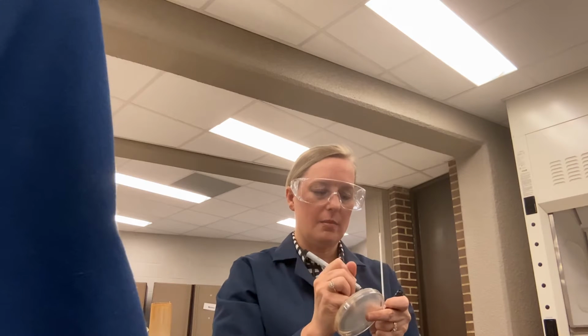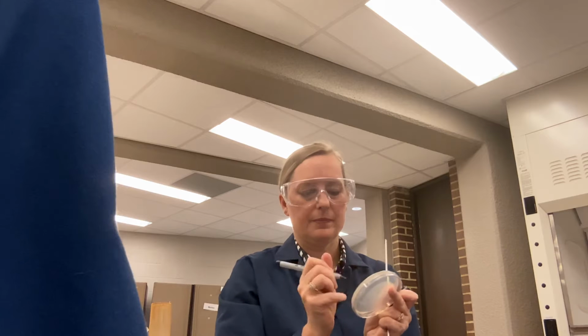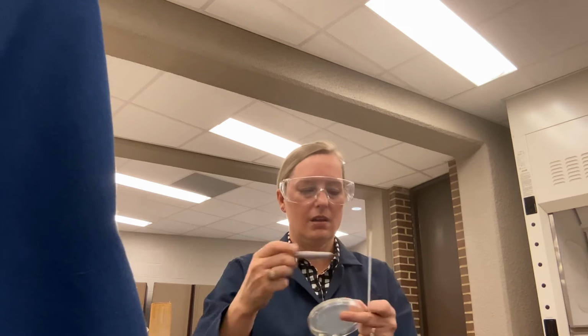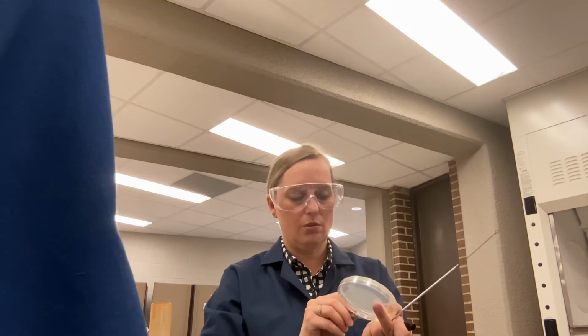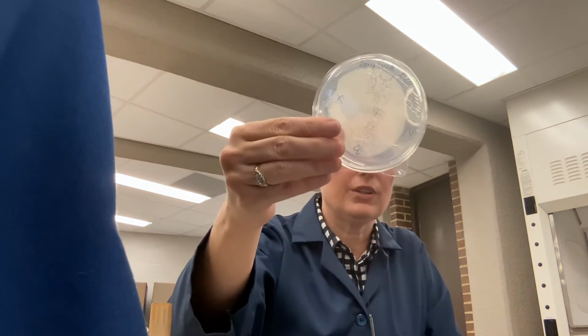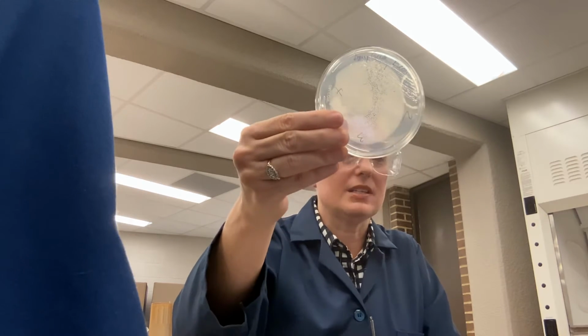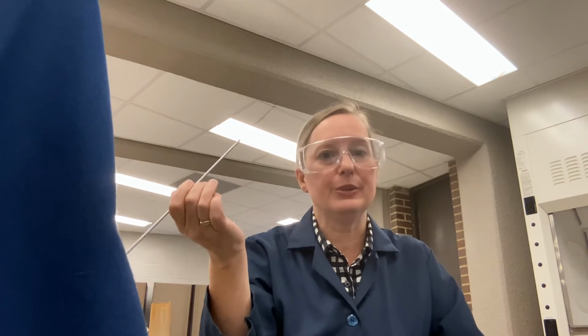And I will go ahead and put some numbers on here so you have a better idea, and I'll show you what that looks like. And the numbers is totally up to you, whatever you want to do. So here I have added 1, 2, 3, 4 on the bottom, because again, if you put it on the lid, the lid's going to rotate. So we're only going to get 1 loop full of broth total. We're not going to go back in because we want to dilute it. We want the bacteria to spread out so we can get individual or isolated colonies.